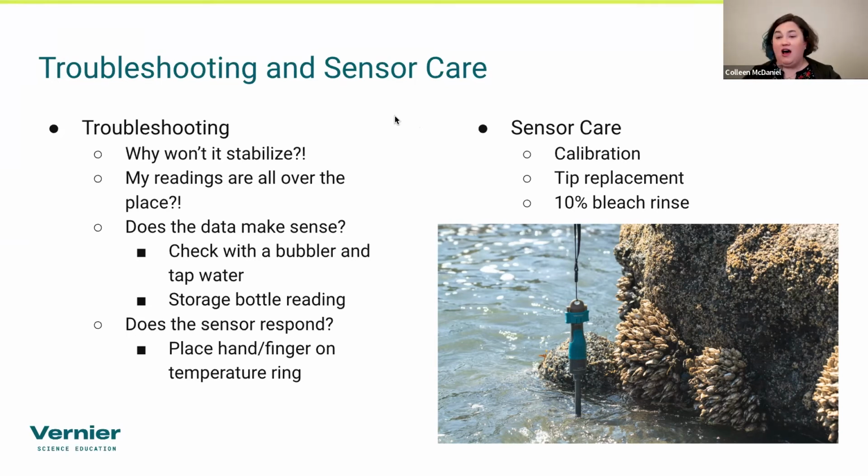With the optical versions of the probe, both of them have a sponge in the tip here that if it dries out, it's okay. They don't have to be stored wet. What I like to say is just a little moist is perfectly fine. So you want to make sure that that sponge stays hydrated. If it dries out over the summer, that's totally fine.